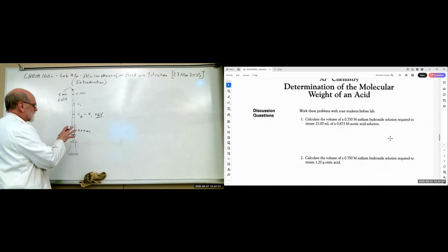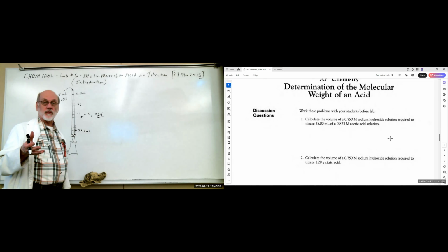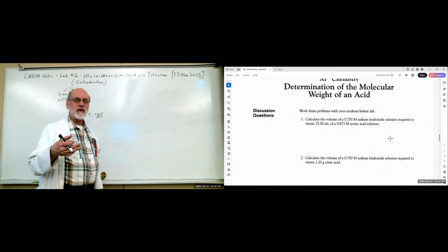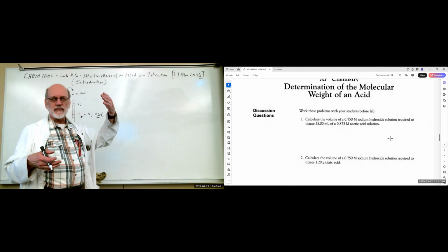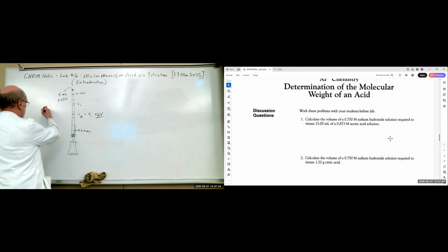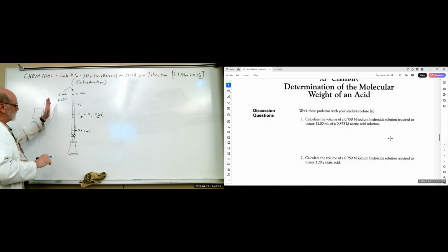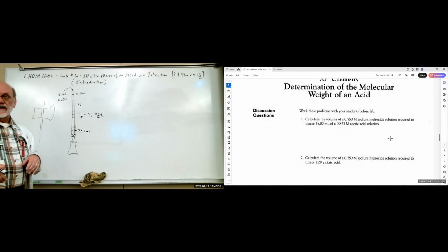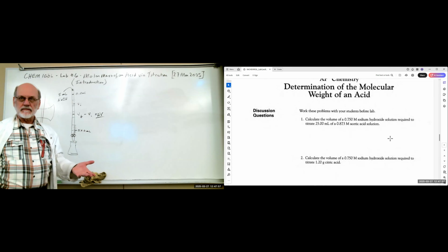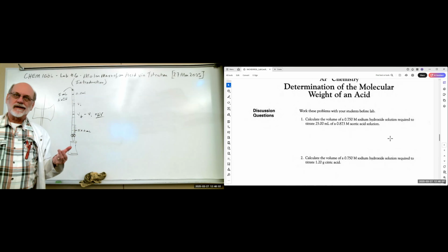Okay. So we've got, well, you know what the ring stand is, right? And on the ring stand, we're going to put this device called a burette clamp. And it fits down over the bar. It's usually shaped like this and like that, and it has clamps on either side, so you can have a burette here and a burette there. That's so that you can do a double titration. In other words, you titrate one direction and then you come back.